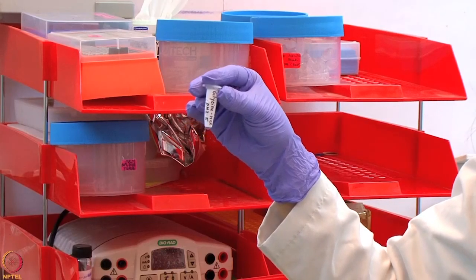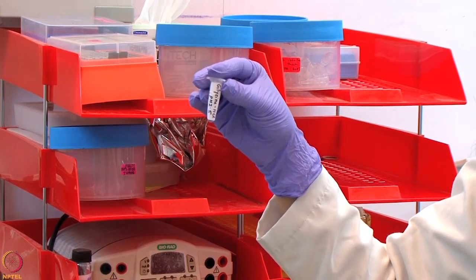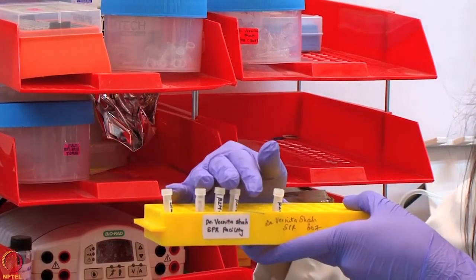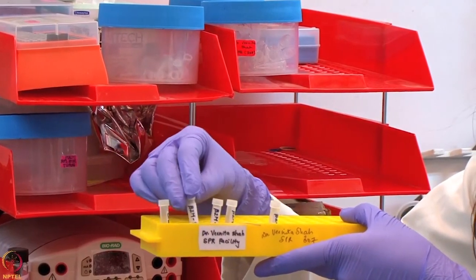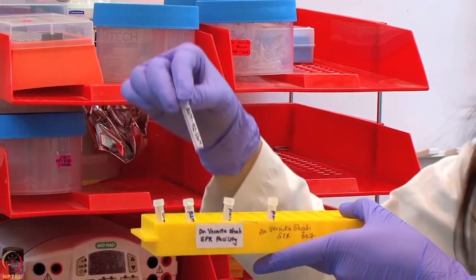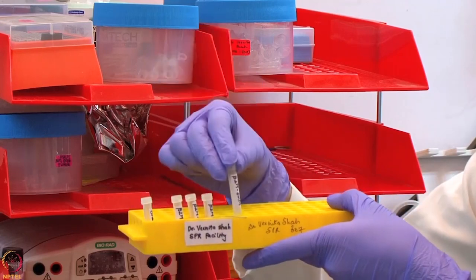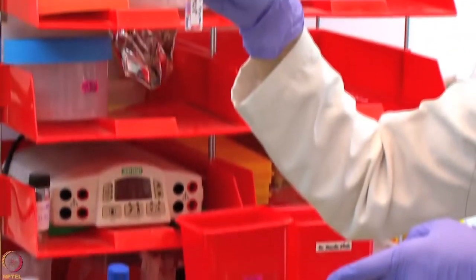For the regeneration of the surface, we have prepared glycine HCl pH 2.5 as the regeneration solution. We have transferred all the solutions in the specialized tube, starting from the startup, beta-2-M concentrations starting from 85 nanomolar, 42.5 nanomolar, 8.5 nanomolar and 0 nanomolar. The regeneration solution is placed in this glass vial.